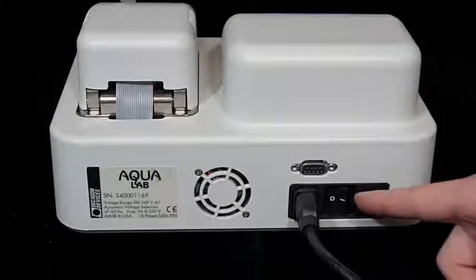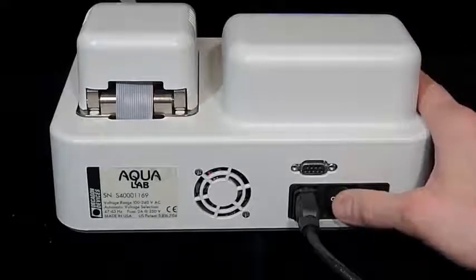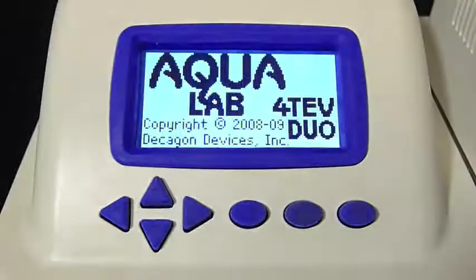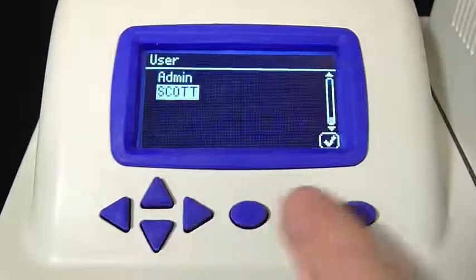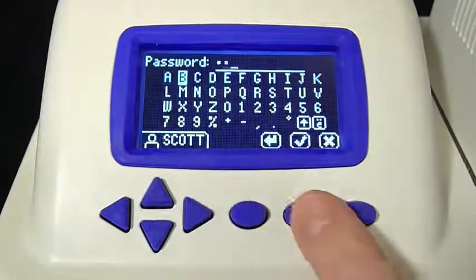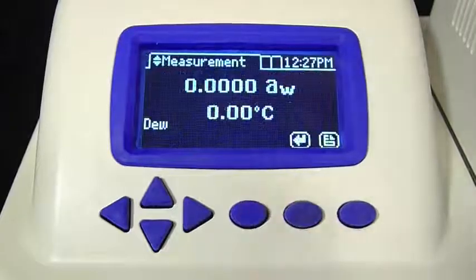Step 1: turn the instrument on. The power switch is on the back of the instrument, down low around the back left corner — it's a small rocker switch. Push the switch on and let the Series 4 start warming up. The Aqualab logo appears at startup. If user profiles have been set up on your instrument, you'll see a user login screen like this. I'll select my username and login with my password. That will give me access to specific functions on the instrument and will record that I was the one who made this reading.